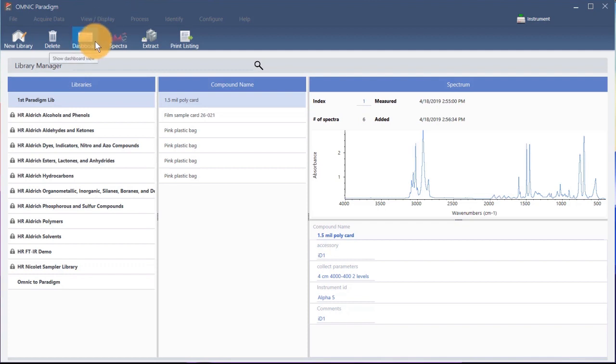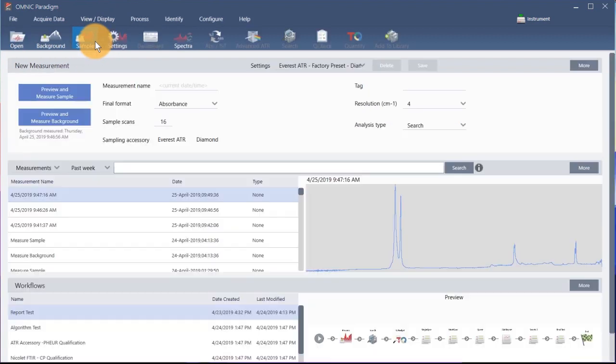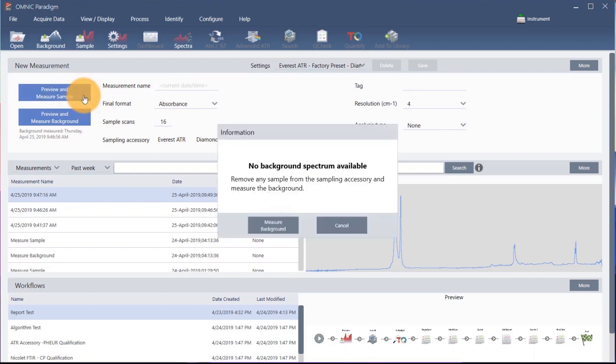Click this icon to return to the dashboard view. To start the analysis, click here. The analysis starts with a background measurement. The only requirement for an ATR background is to make sure the crystal is clean. The background spectrum is used to eliminate any signals in the sample data that are due to the spectrometer, the ATR crystal, or the background environment.